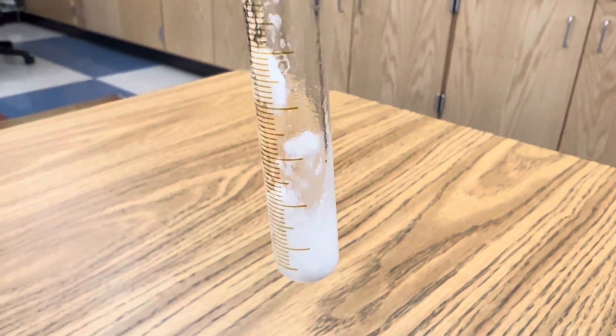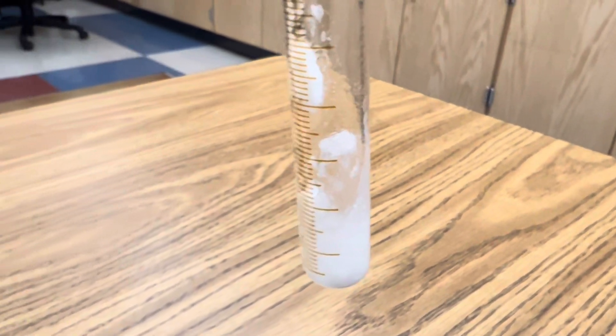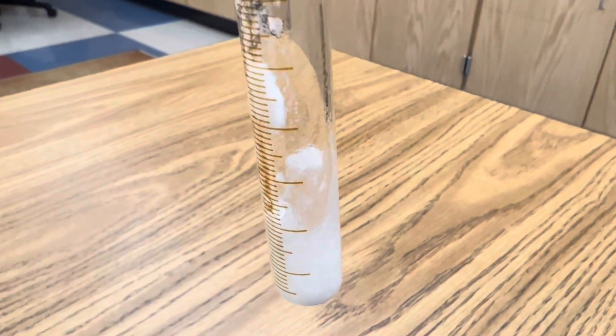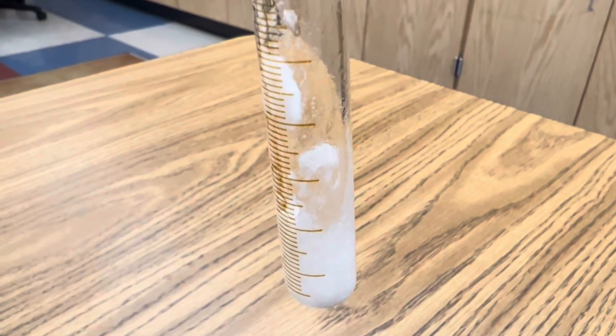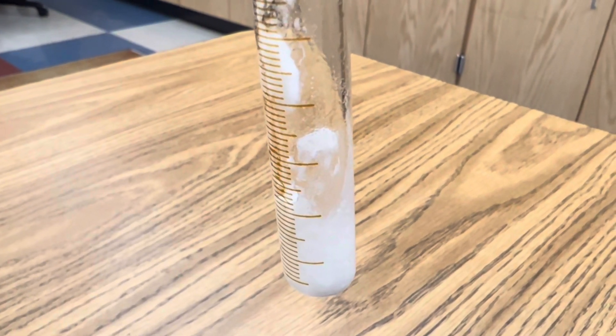So the products in this reaction are sodium chloride and hydrogen gas, and you can actually see sodium chloride crystals sticking to the side of the test tube. Very cool. Single displacement of sodium and hydrochloric acid in Ramseyland.